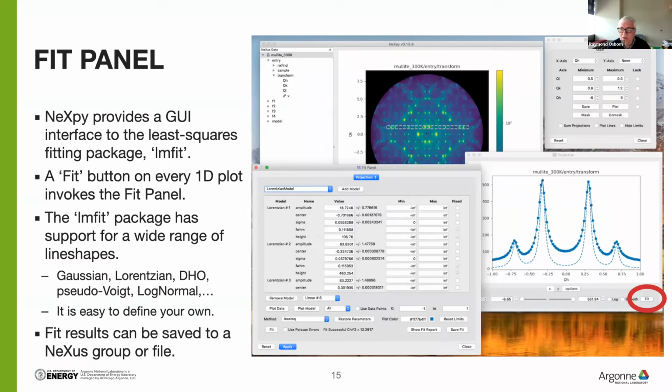A fit panel, which is a GUI interface to LMFit, which is a very nice package, the project led by Matt Newville here at Argonne. Actually, Spec2Nexus, which we use for importing spec files, was written by Pete Jemian at Argonne. So it makes me appreciate that. I didn't realize what a powerhouse Argonne was in the software field. But anyway, there are some very useful tools that we produced because we needed them. Anyway, and I'll actually give you an example of using this panel.